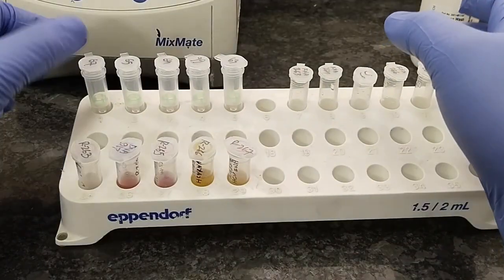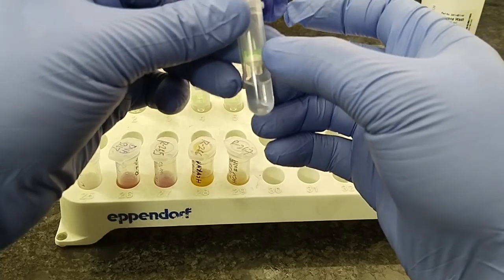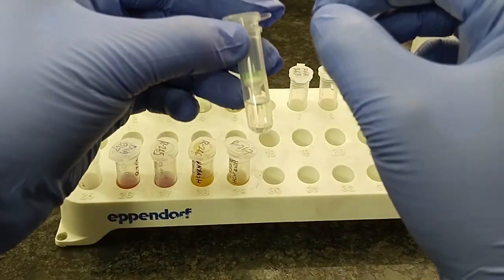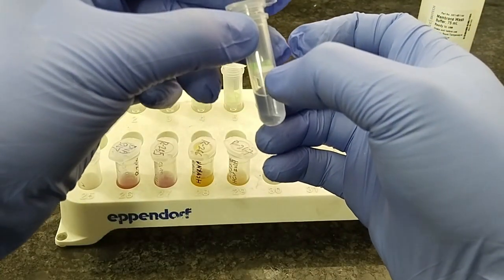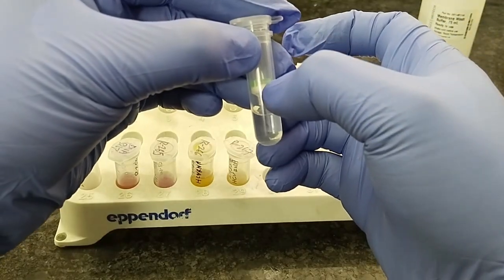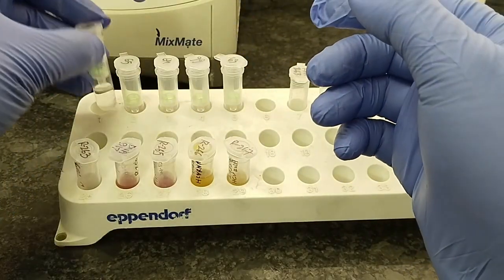Centrifugation is done. As you can see, all of the solution gets filtered out and collected in the collection tube. If there is any RNA, it may get trapped in the column. This is the column, and this is the collection tube.